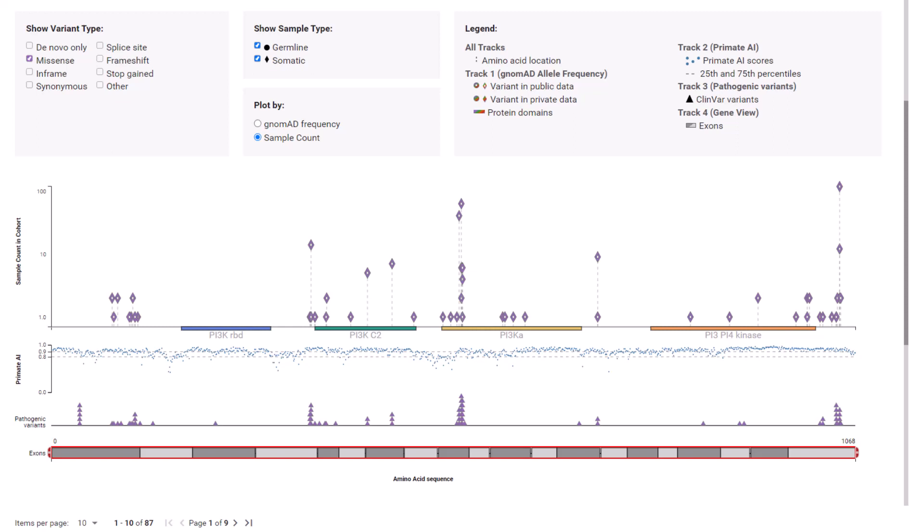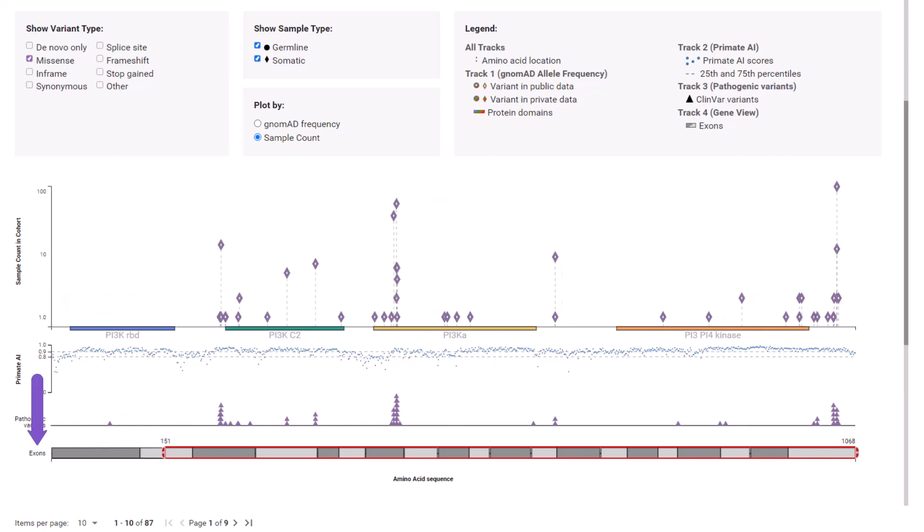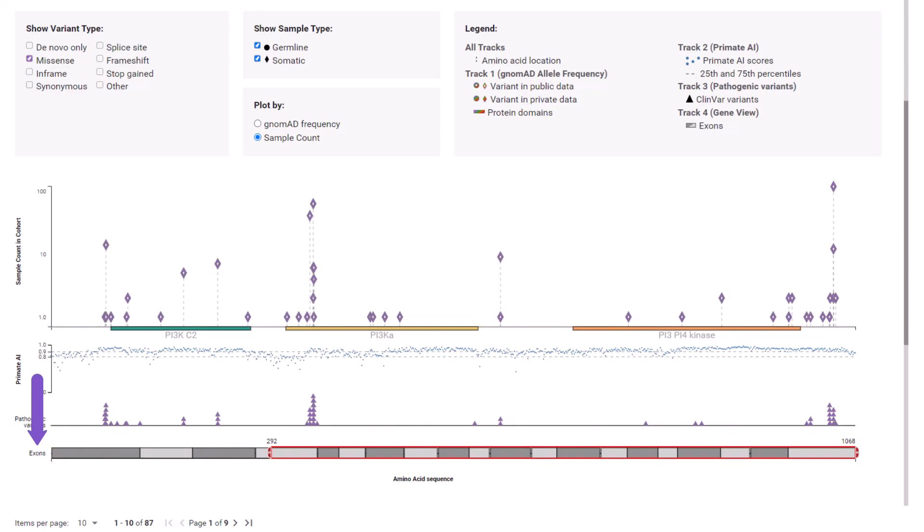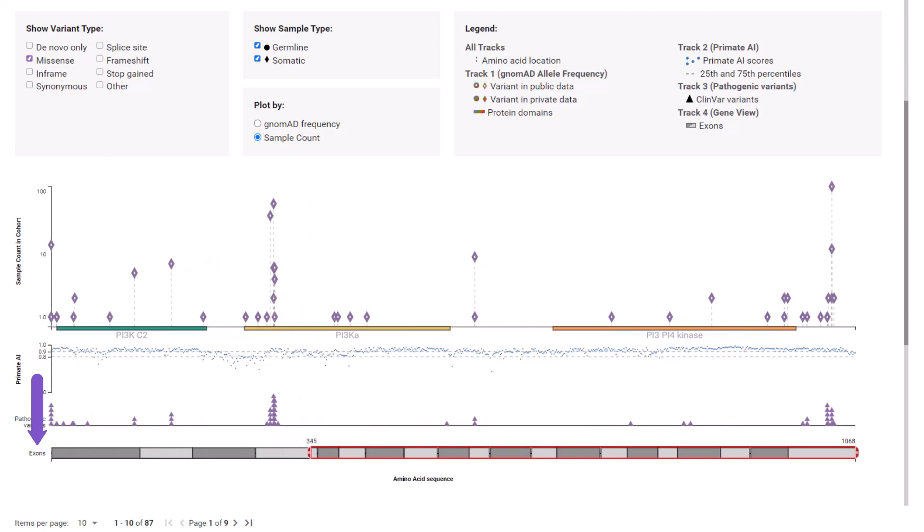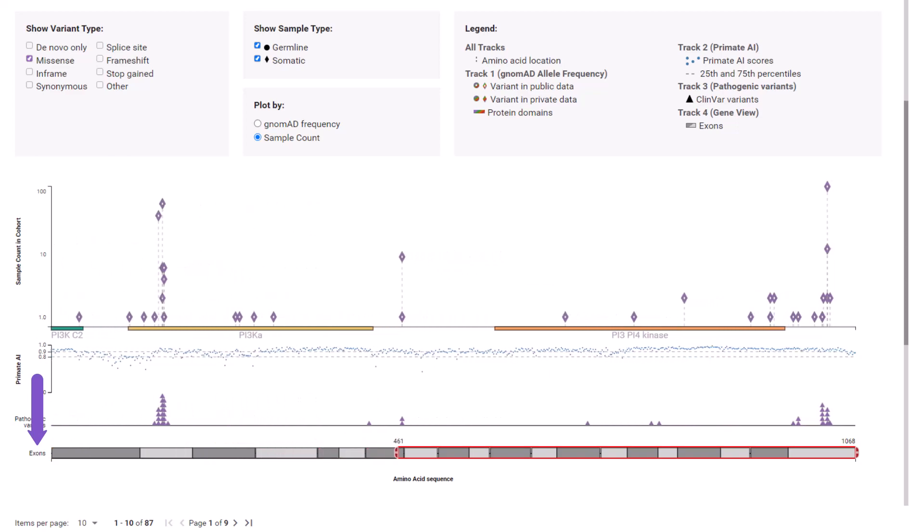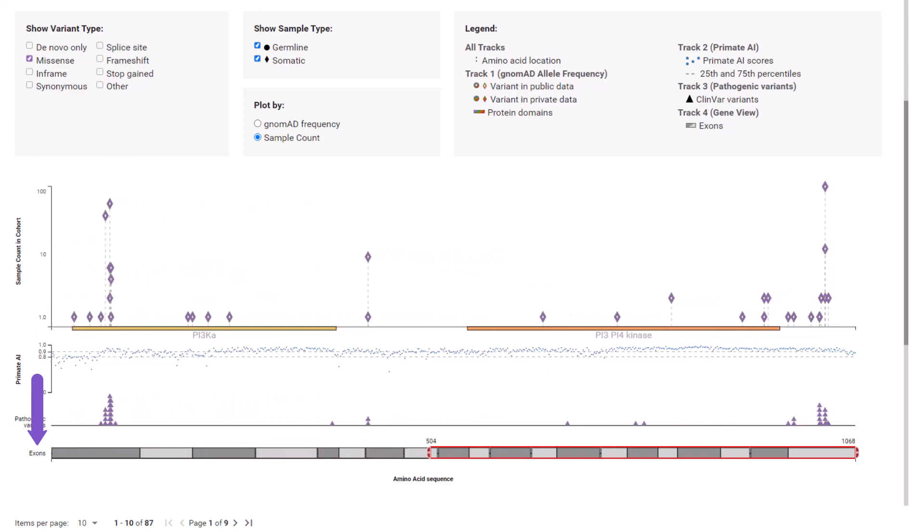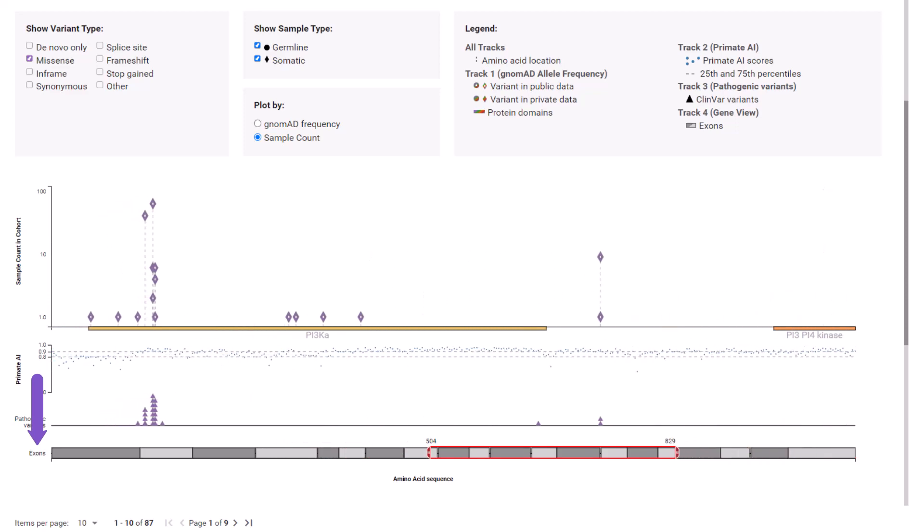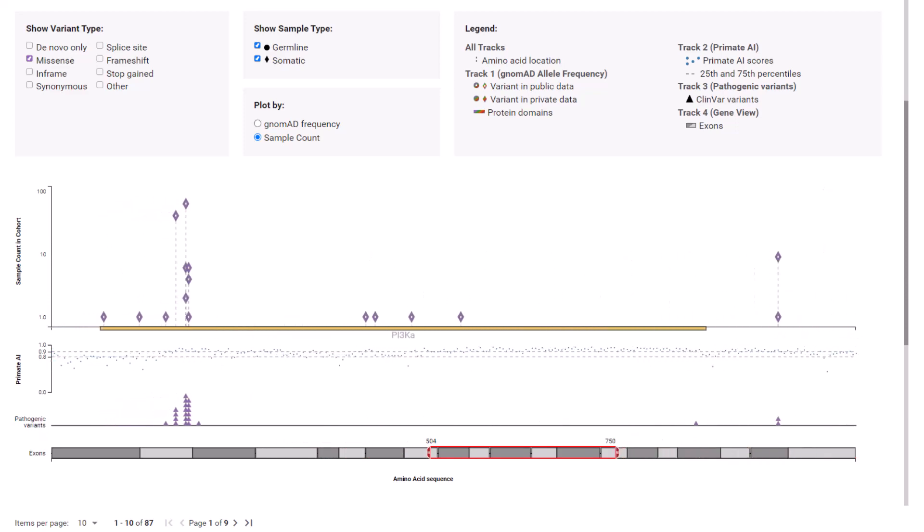Points below the 25th percentile may be considered likely benign. The Pathogenic Variants track displays markers from ClinVar color coded by variant type. Use the exon zoom bar from each end of the amino acid sequence to zoom into the PI3KA domain to better separate the observations.